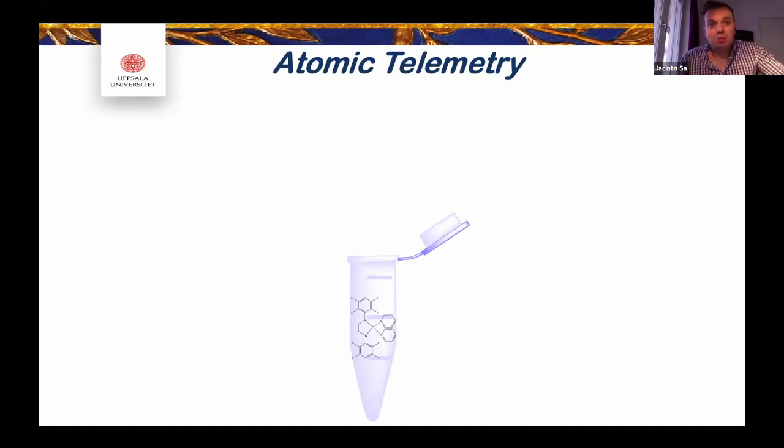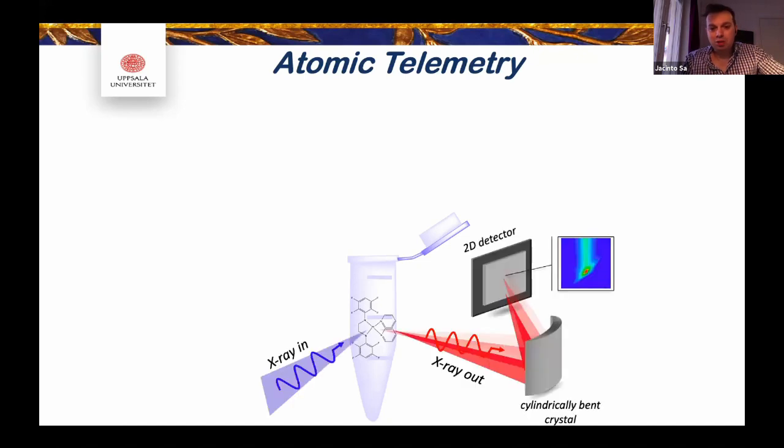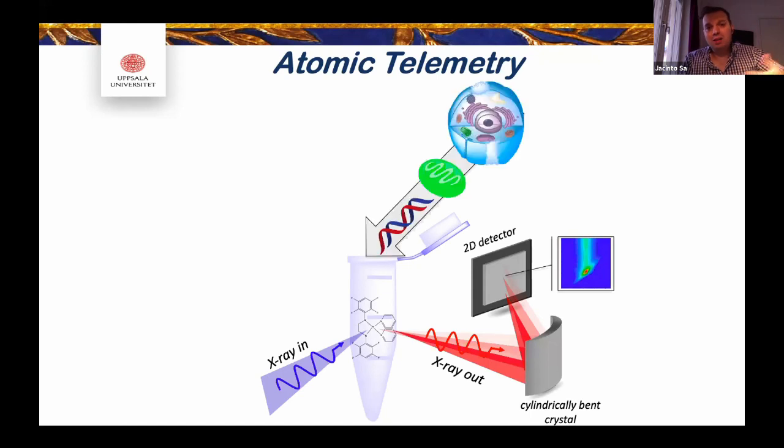And then you would have to deconvolute this from the data that you measure. And in the case we are using hard X-rays, we can penetrate to, in this case, you could think about your just Eppendorf, measure the drug with your X-rays, you can measure the absorption and emission, and then you can keep adding things to it to basically understand how these drugs bind to the body.